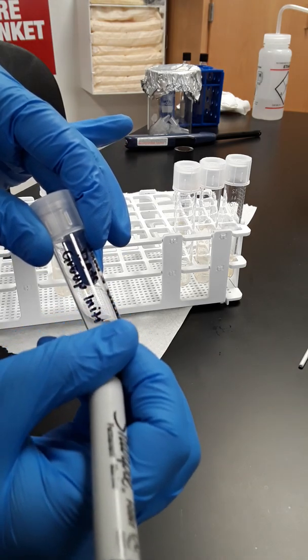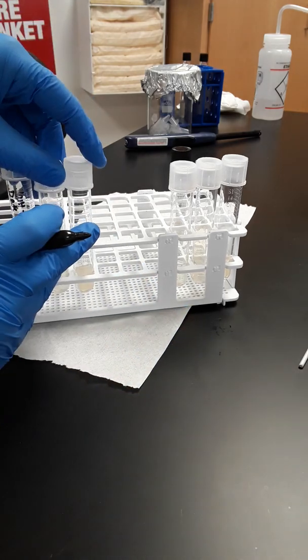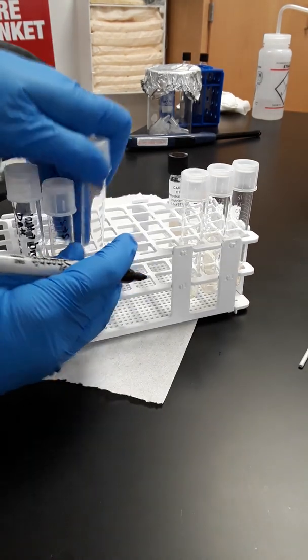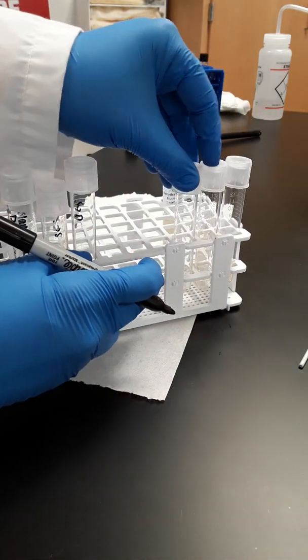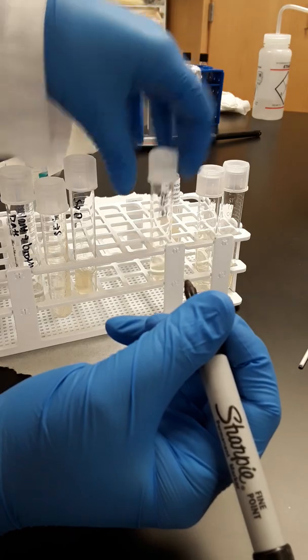And you're going to label all of them similarly to that, like where is it coming from? All three of these are coming from a slant, so you could abbreviate that S. However you understand it, so like this is slant to slant, this is slant to deep. However you understand it is fine. And then all of these are going to be from broth, so maybe this we're going to say broth, and this is another broth, broth to broth.